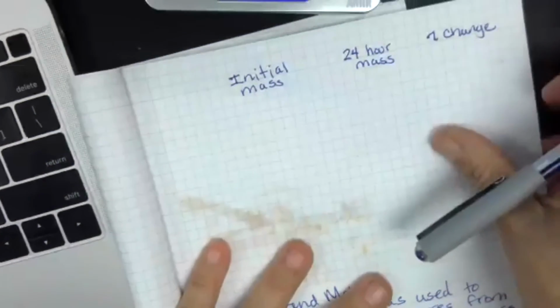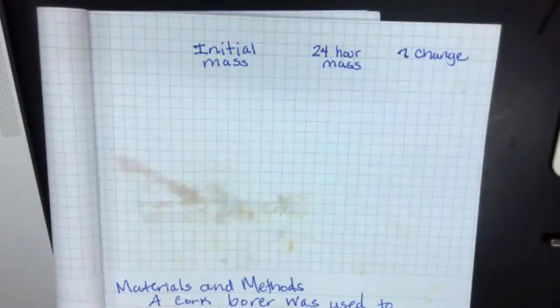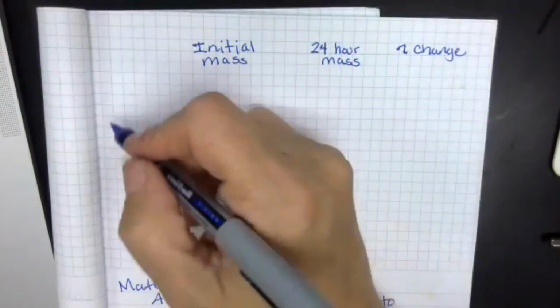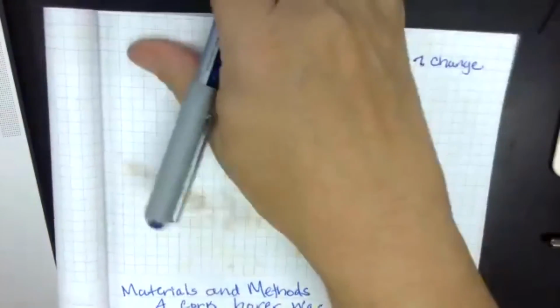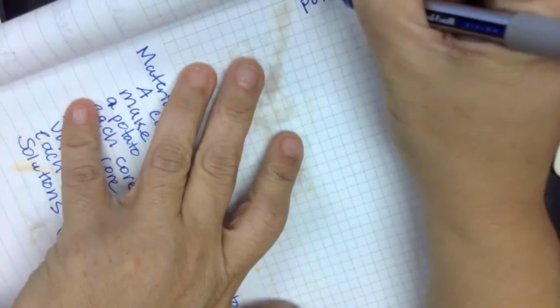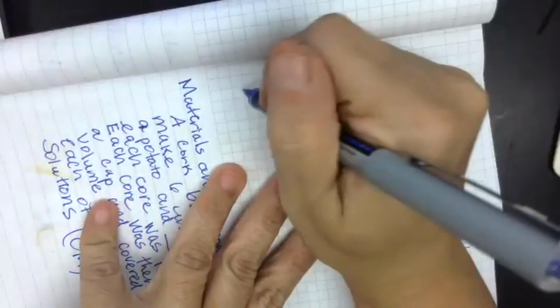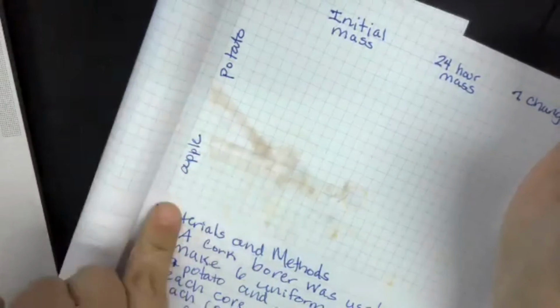And we need to have our potato and then each molar. So I'm going to go ahead and write my potato masses here. It doesn't matter that you write the table this way. Like I said, I'm not that good at making these tables up on the fly. Yours is obviously not apple.